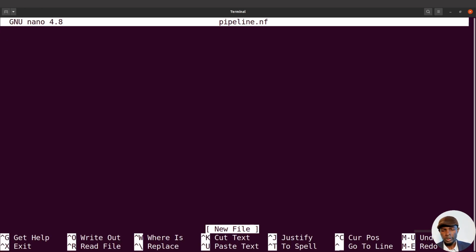You can use any text editor. That's also fine. All right, ladies and gentlemen, welcome to Nextflow 101. So we will start by defining some parameters. So I'll start with this one. I'll say params.linkfile equals, and I'll specify the file which has the download links. All right. So I'll bring my quotes and I'll say /home/kobna/nextflow/links.txt. That is the file.